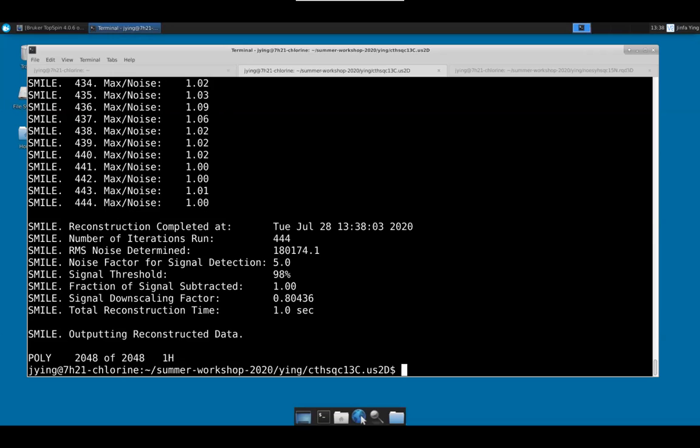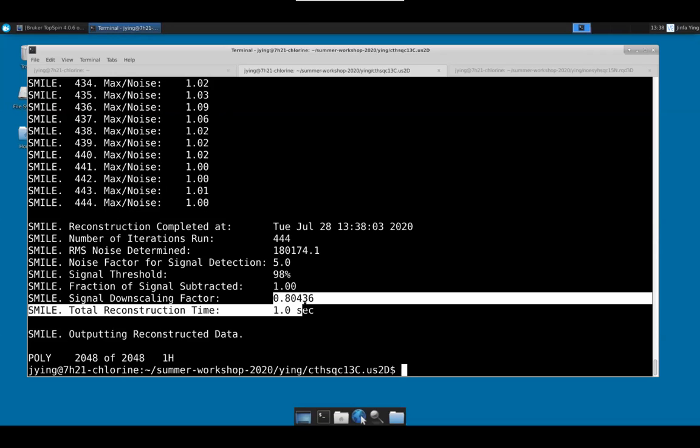All right, and this scaling factor here is because you extend the signal by another factor of 2. So if you don't scale them, your peak height will be higher. And I tried to use simulation to figure it out, saying that a downscaling of 0.8 will make your signal as high as what you have without extension.